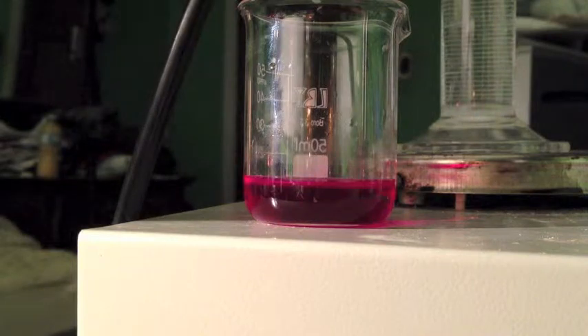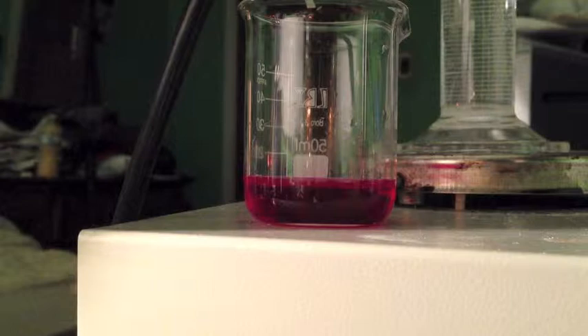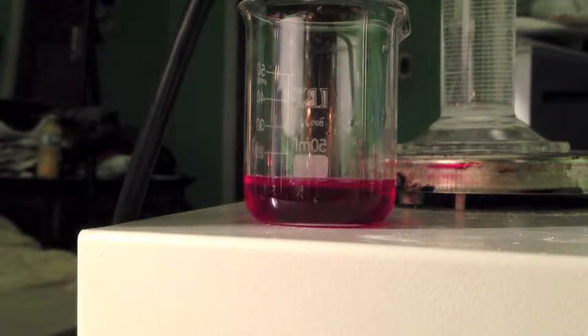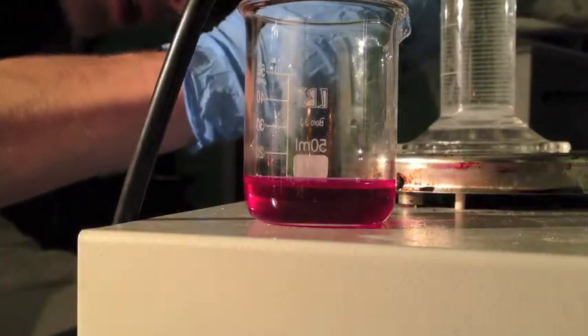And that is 4.75 mils of sodium hydroxide.